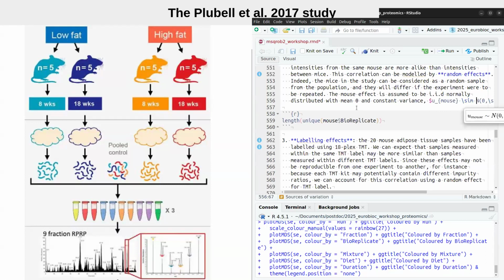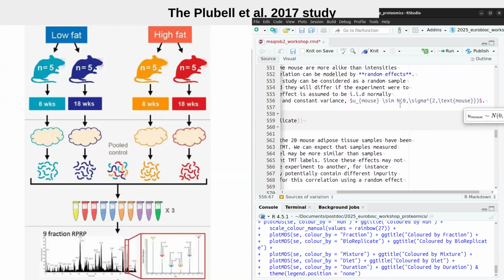With this data, we can see that the effect is like a hierarchical one. And we will basically model this blockwise correlation structure.